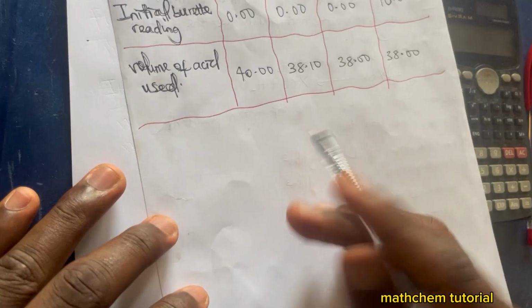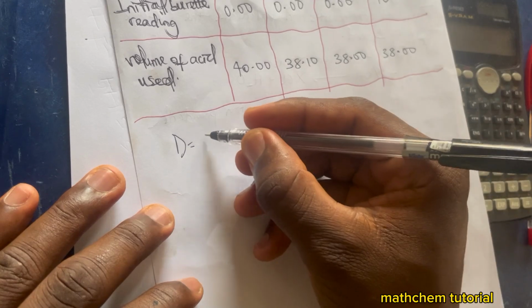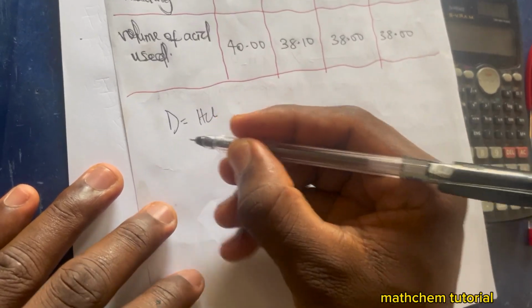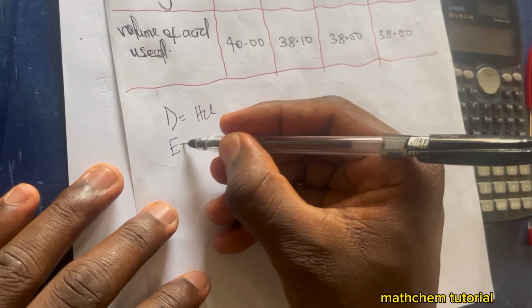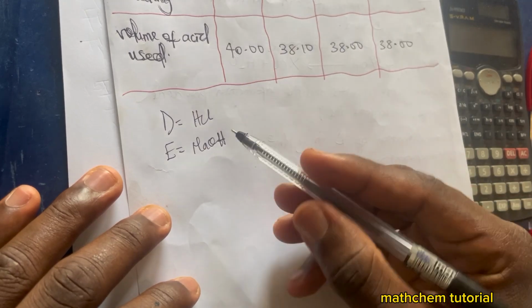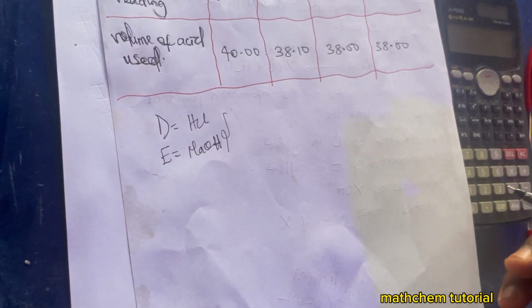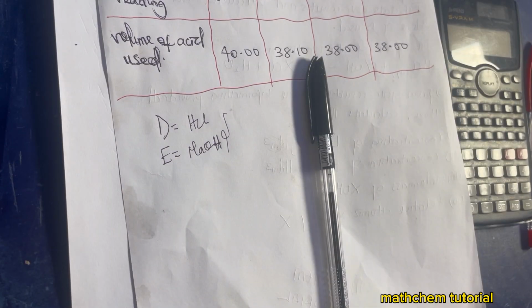The specimen for this year: sample D is the acid, so they call it HCl, while sample E is sodium hydroxide. So for alternative B, these are the two solutions we are titrating together. So the setup would be like this.